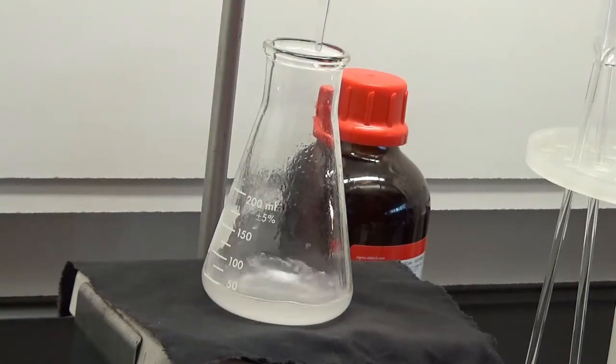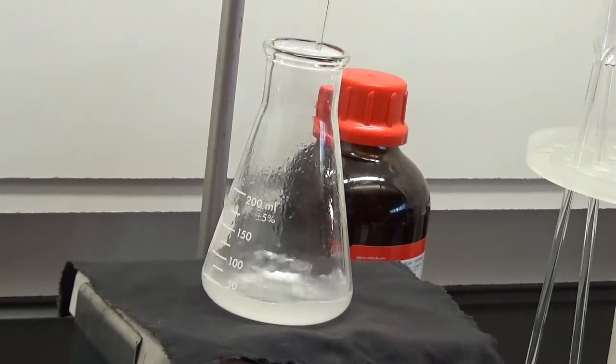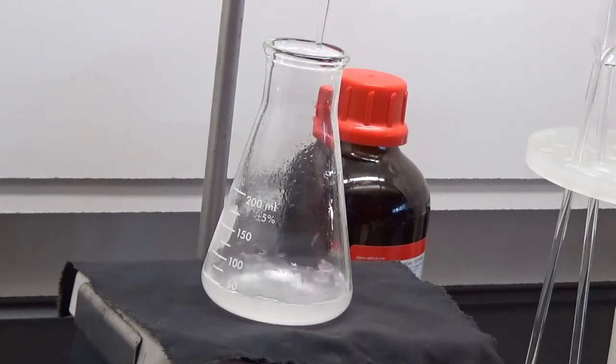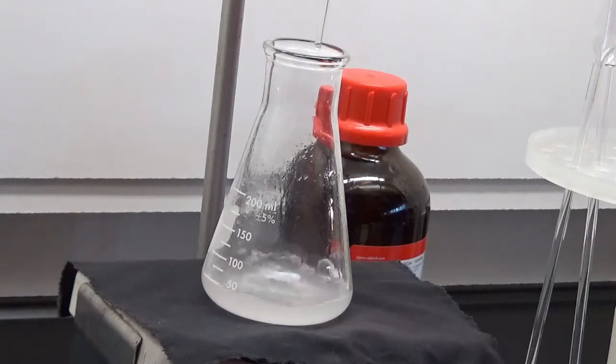That's 12 drops now. That's 10 more drops. Still looks cloudy. Turn the light out. Definitely cloudy. Still looks cloudy. Still cloudy.